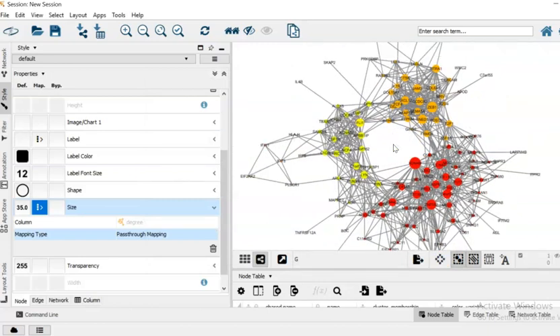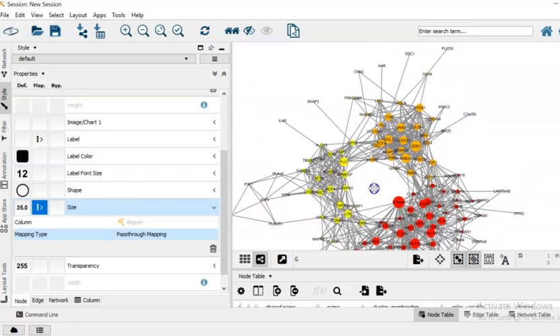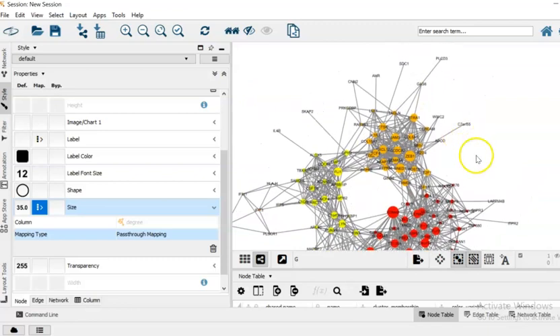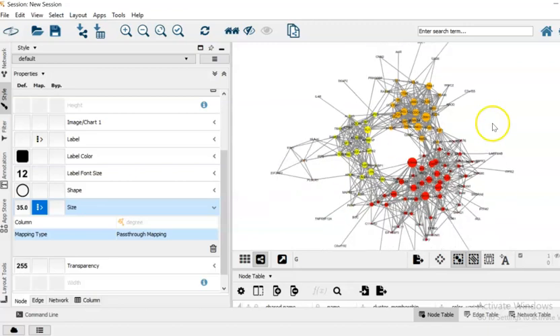And with this, this part of the tutorial is going to be completed. So we have generated co-expression network of undirected and unweighted type, but we have identified the local communities and the hub genes of those communities.